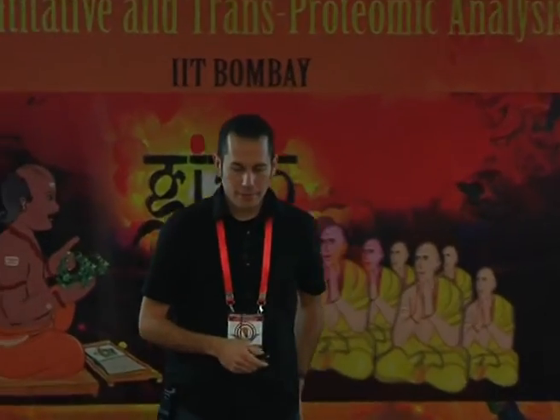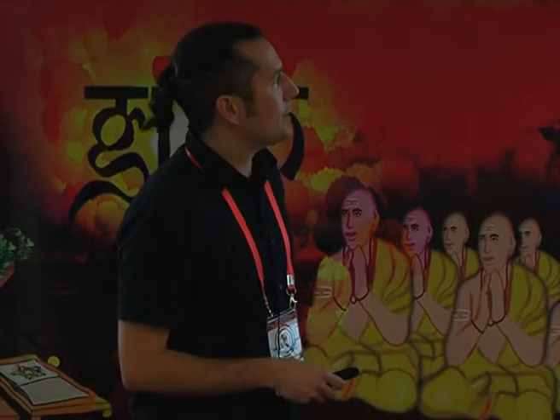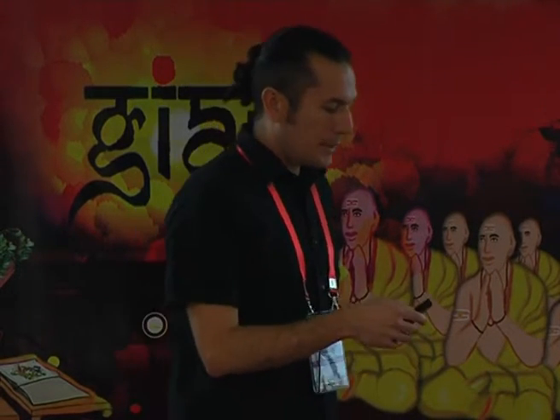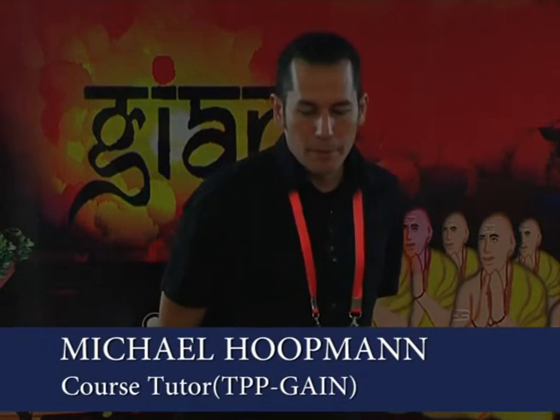Mike? All right, good morning, everyone. As Rob introduced, I will be starting this morning's lecture. And so we are actually going to take a step back and talk a little bit about database searching again, but using a specialized algorithm specifically for detecting protein crosslinks.